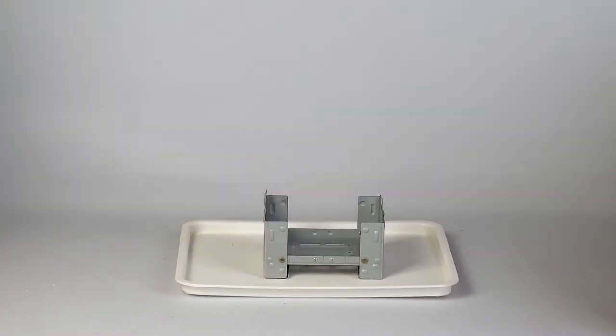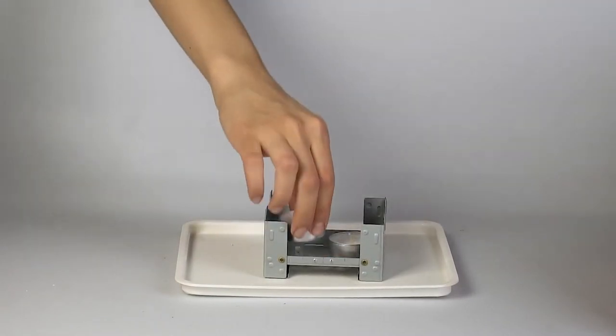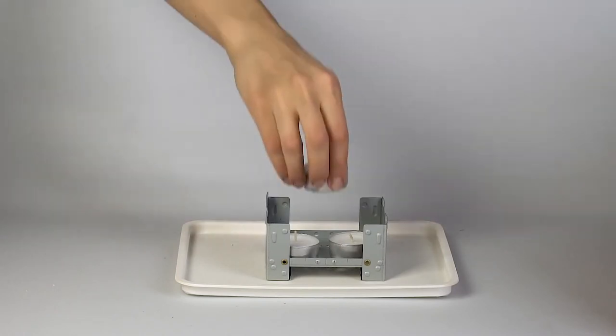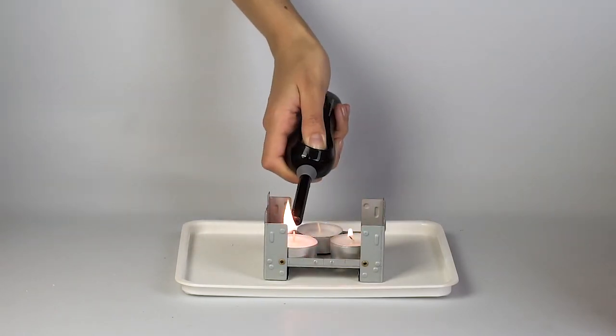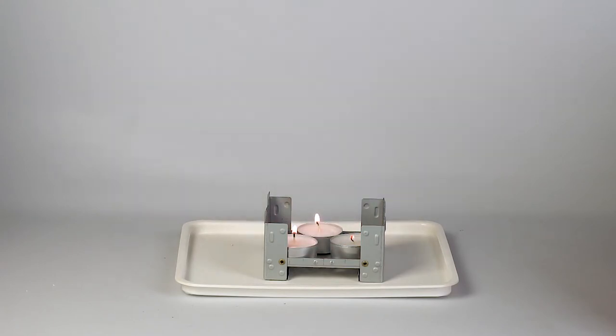Place the stove onto the tray and set three candles in it. Make sure you remove your protective gloves before lighting the candles. Light the candles and cover the stove with the flame diffuser.